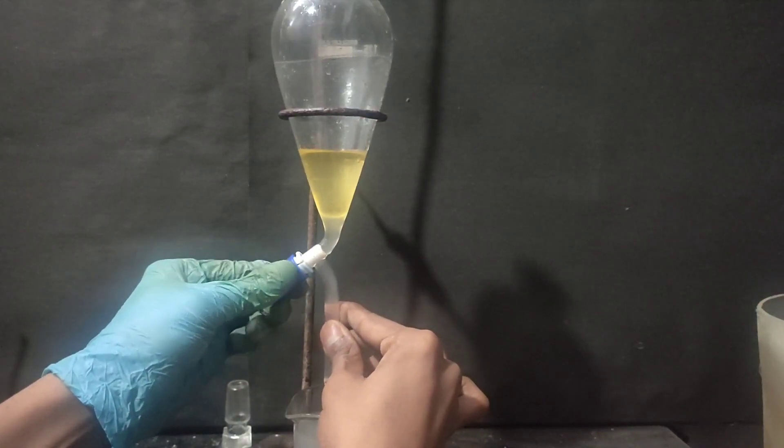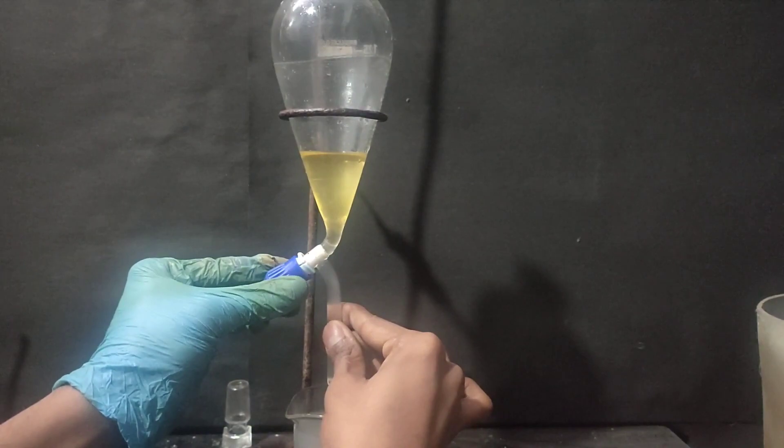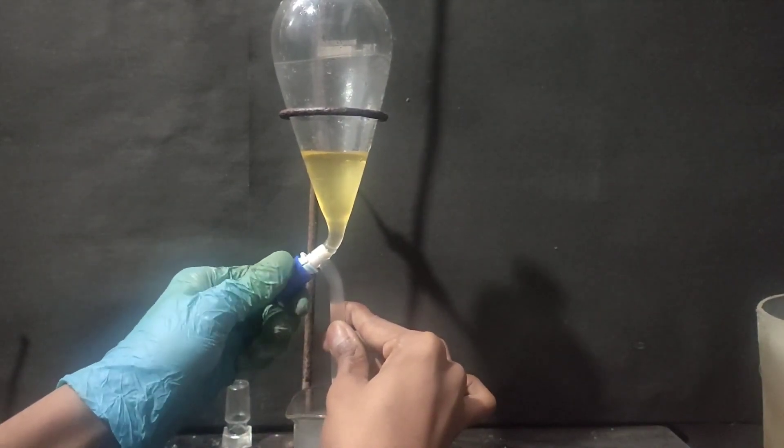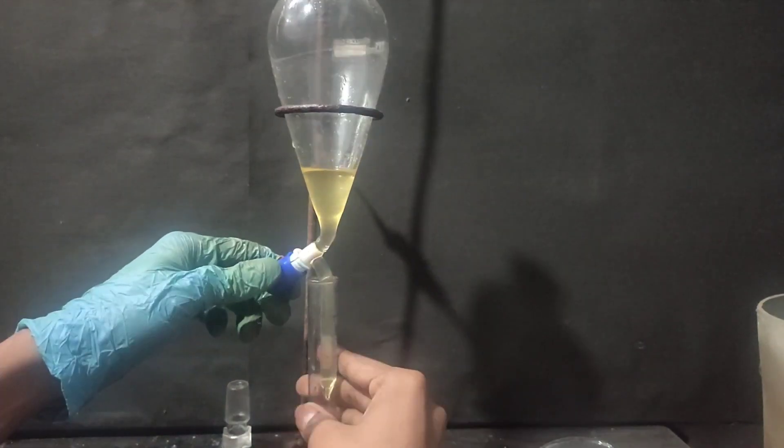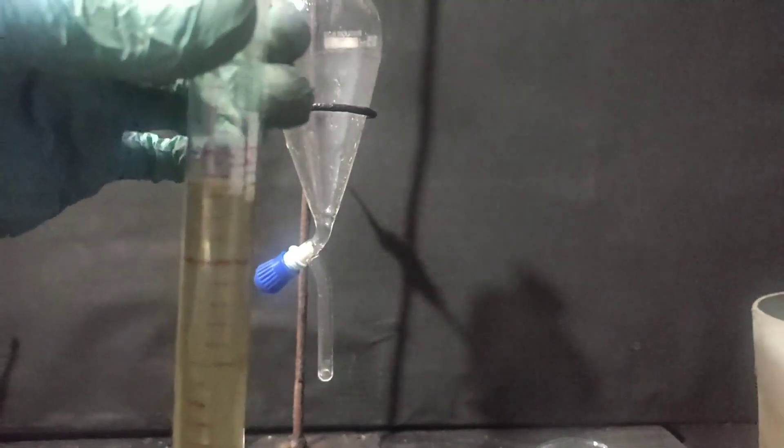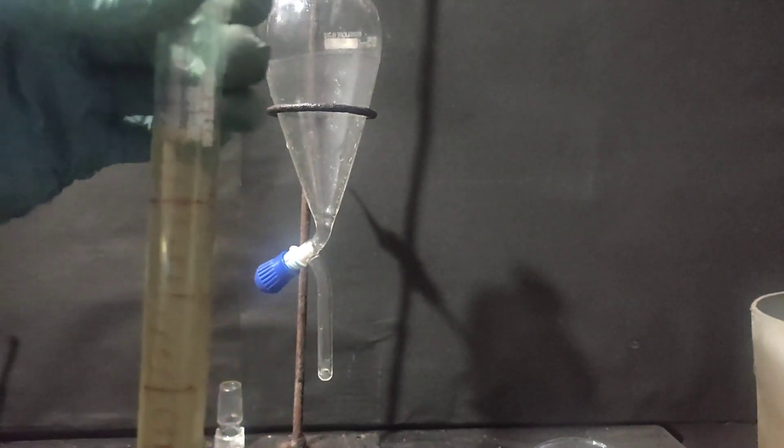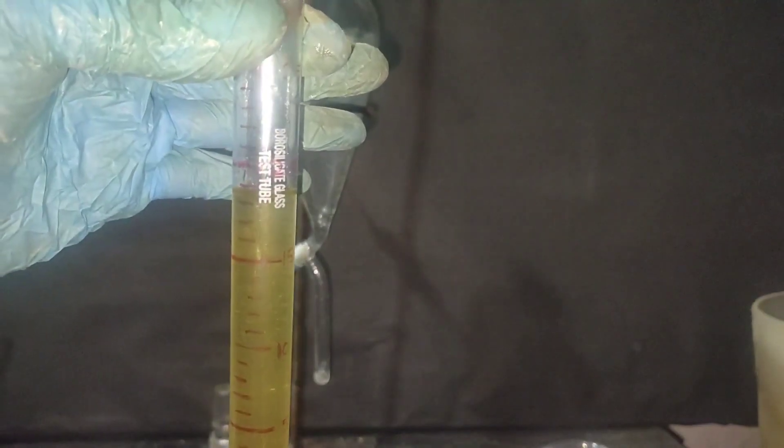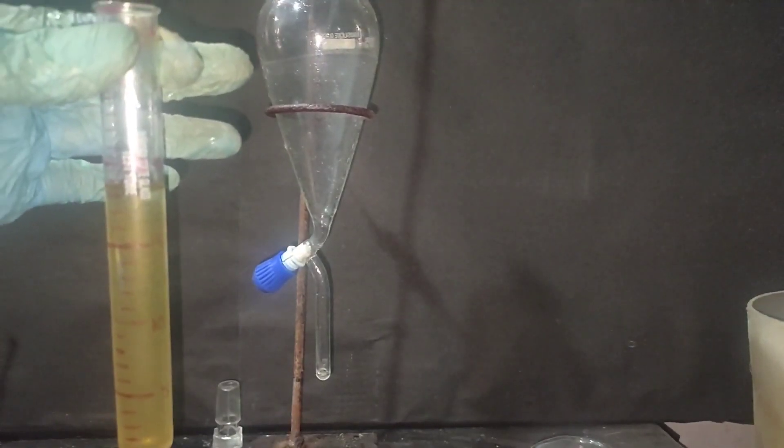And this time, the lower layer was the aqueous layer because on adding salt, density of water increases. The aqueous layer was drained off and discarded. Then the benzaldehyde was collected in a graduated test tube. And it was seen that around 1.5 ml of benzaldehyde was lost in the washing step. So now we are starting with 18.5 ml of benzaldehyde.